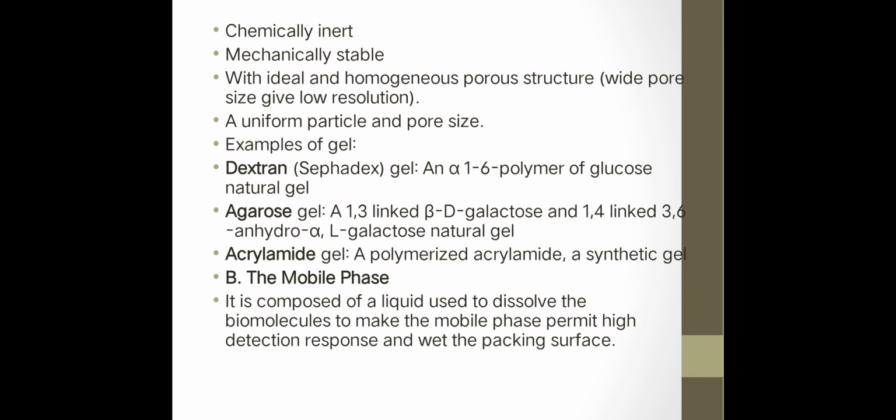Then the mobile phase is composed of a liquid used to dissolve the biomolecules, permit high detection response and wet the packing surface.